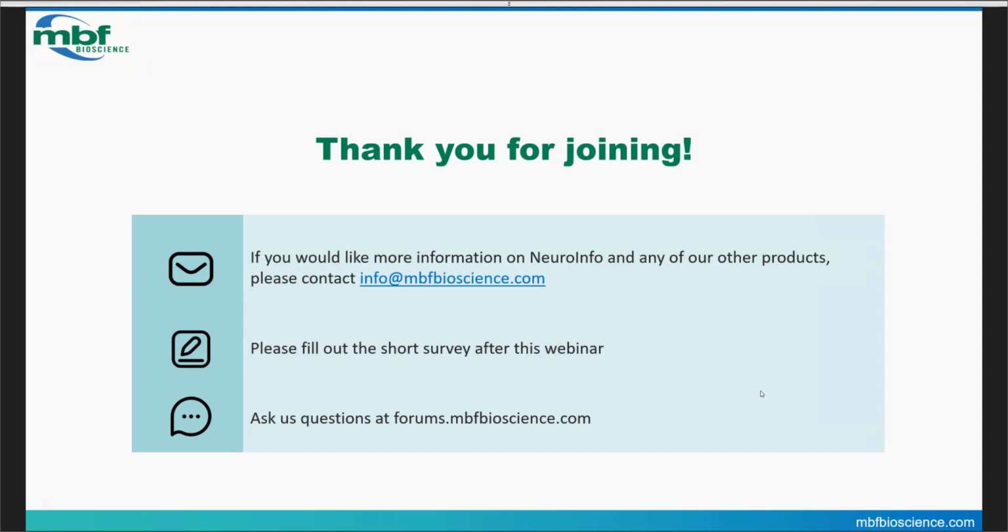Just a couple of last questions here. Someone asked, and I want to point this out, is it necessary to do whole brain reconstruction to get your individual sections registered to the Allen Atlas? No, I would refer you back to the other webinar, where what we actually do with serial sections, because they're somewhat decoupled from each other, even after this rigid registration to each other, when we go to the Allen, we find individual transforms for each serial section into the Allen space.